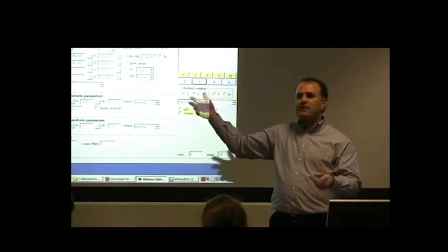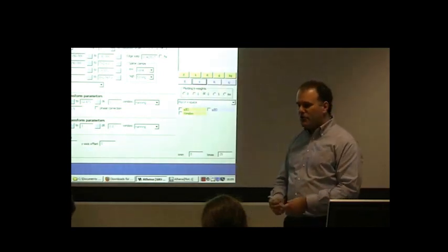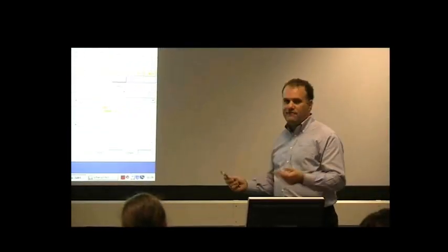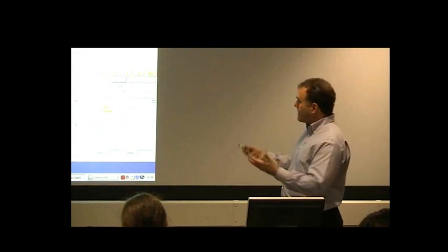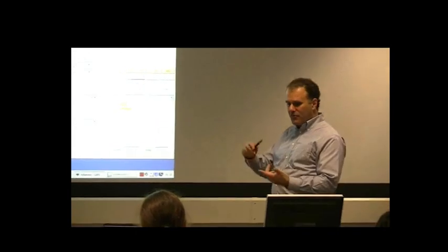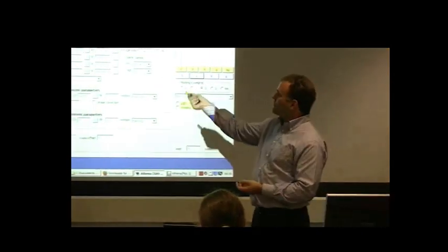So you have to do 2 things to get an ensemble of data like this ready for displaying the ways that we want to display it here. We have to align, and we have to make sure that the E0s all make sense.